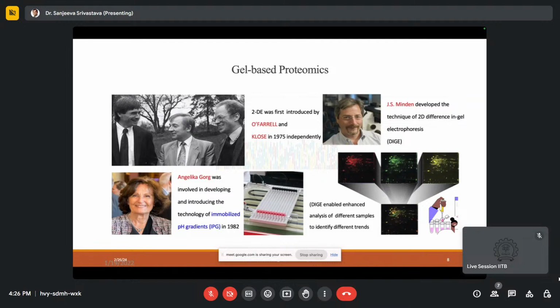In case of the complex proteome mixture, you want to look at many distinct bands throughout from the high molecular weight to the lower molecular weight. And you want to be sure that they're not degraded. They are sharp bands and they are representing all the range of molecular weight.